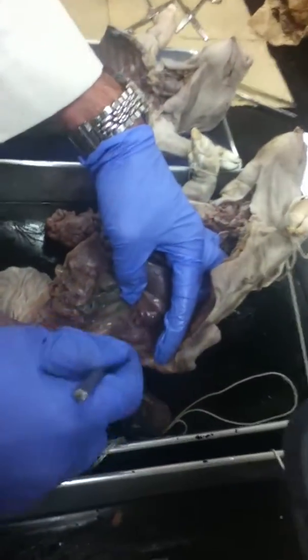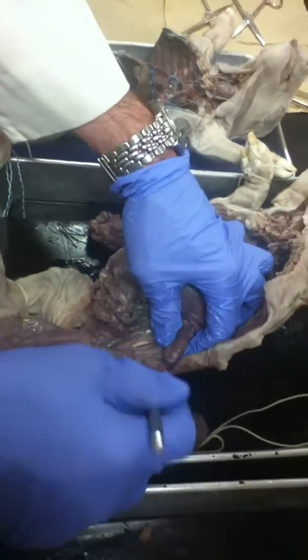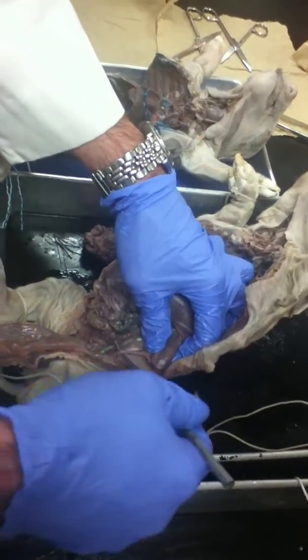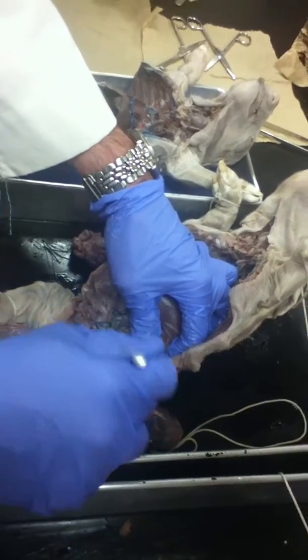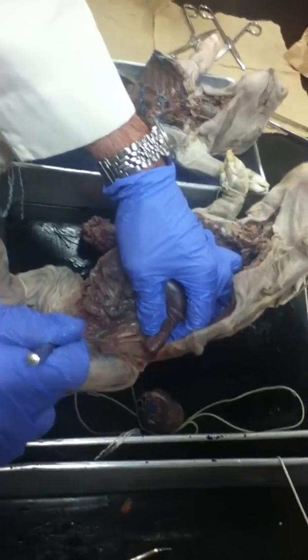Kidney. This is a kidney here. Ureter. That is a ureter right there. It looks zigzaggy a little bit. That's the ureter, which connects to the urinary bladder.